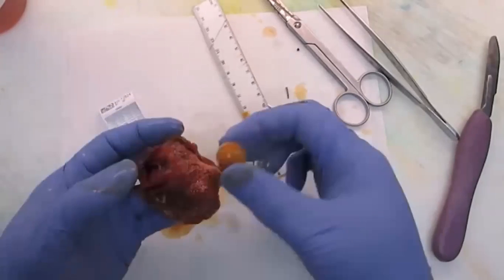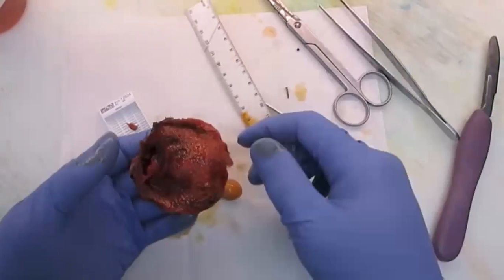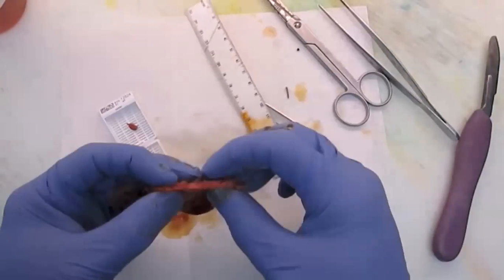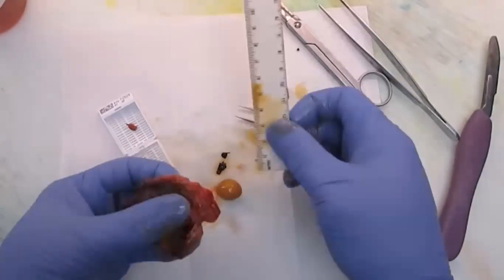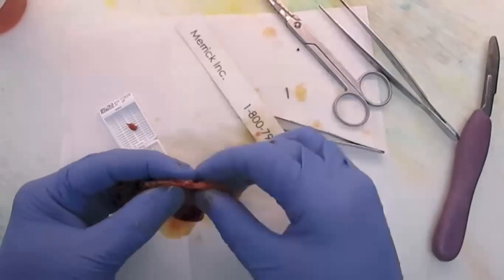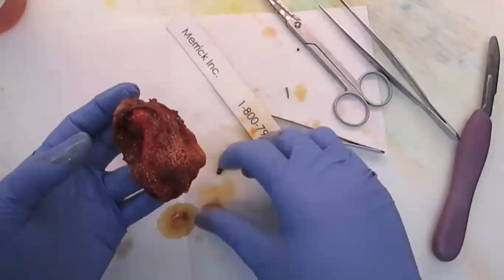And also there's a stone in here. So there's a gallstone. The mucosa is red brown and has diffuse yellow streaks. And then we'll say the wall thickness measures up to 0.3 cm. And then we'll talk about the stone.